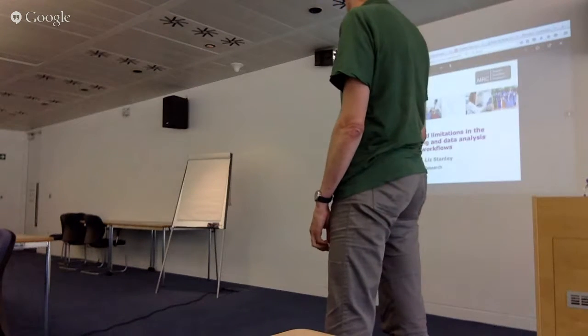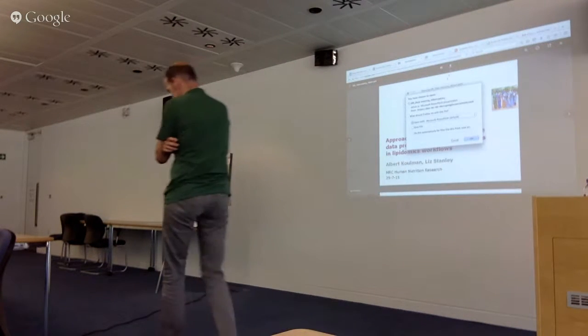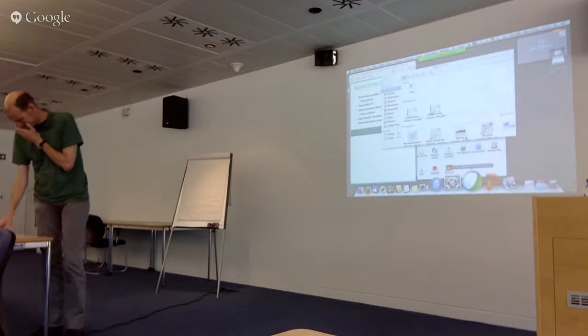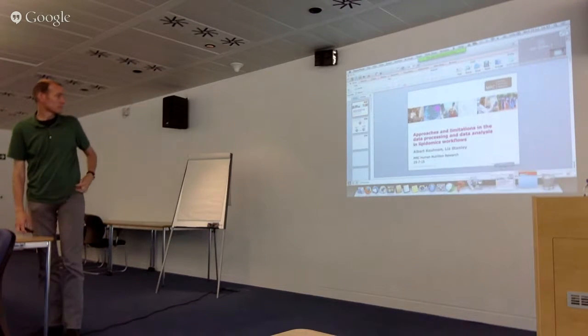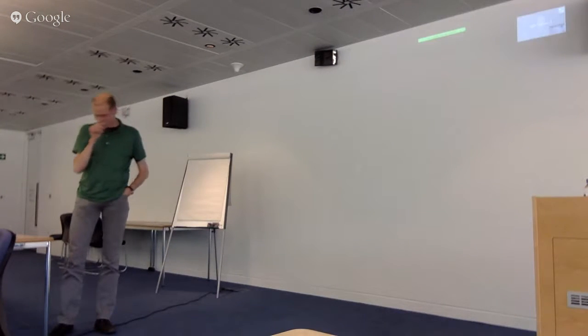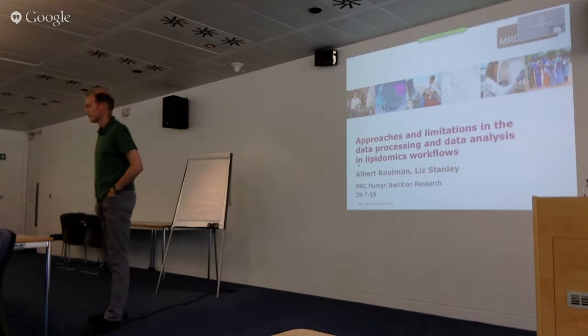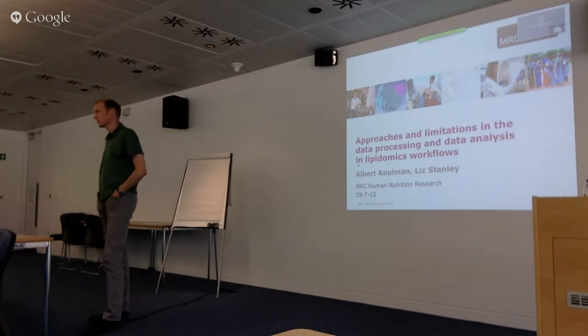But there are other formats that are not considered standard, but have been developed by other people because mzML cannot fulfill all the needs, because we need to access the data in a particular way. Of course, the XML way is very inefficient. But mzXML, I'm sure it will die. Of course, it's still widely used because it was used for many years. But this is the trend.